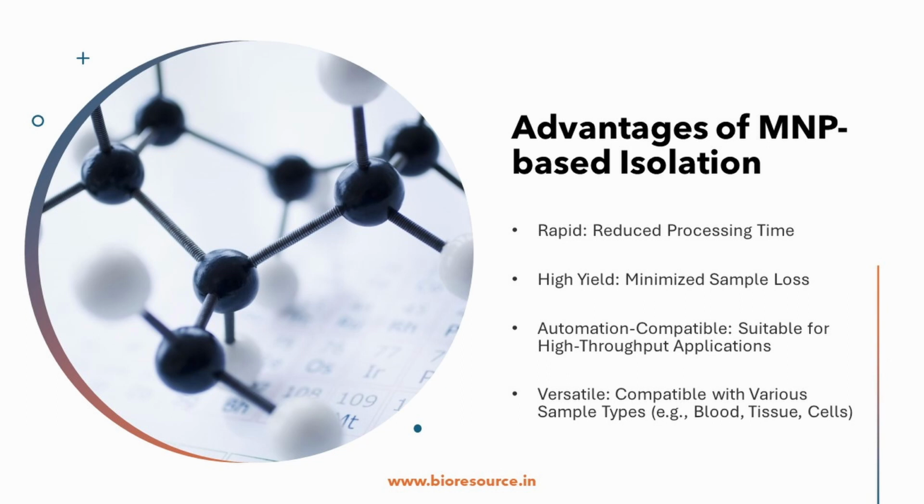by a robotic system. The automation capability makes the MNP isolation ideal for processing a large number of samples efficiently and consistently, and is a crucial factor in high throughput applications like clinical diagnostics. So where you have a large number of samples which you need to process, it can be automated, and it can be done very quickly with high throughput.